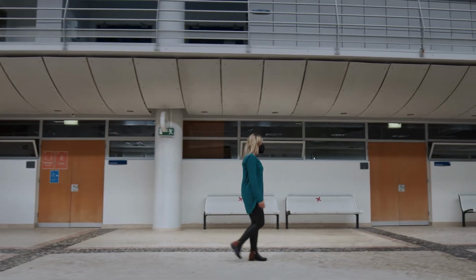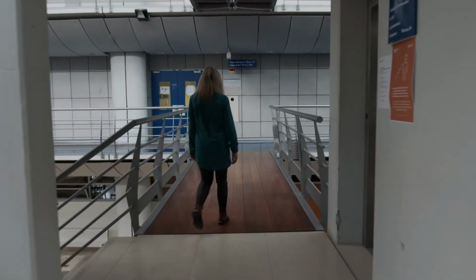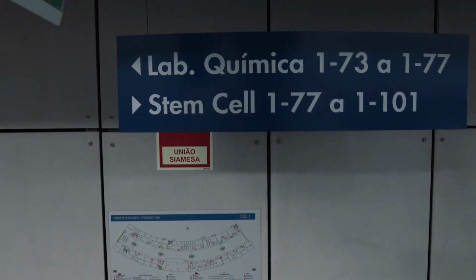So my research has been focused on the development of scalable platforms for either expansion or neural induction of human pluripotent stem cells using suspension aggregates. So we can say that basically my whole research is based on the stem cells as a starting point.